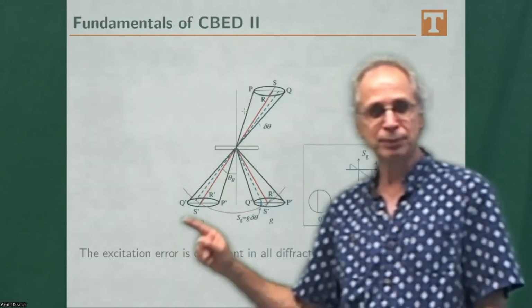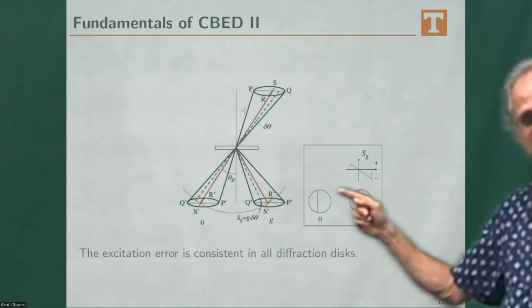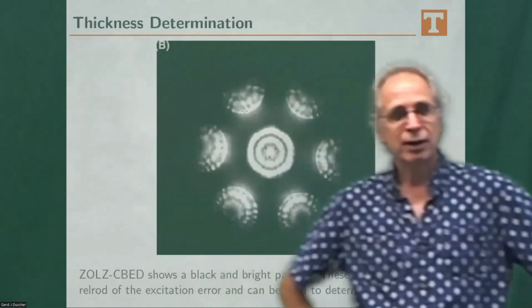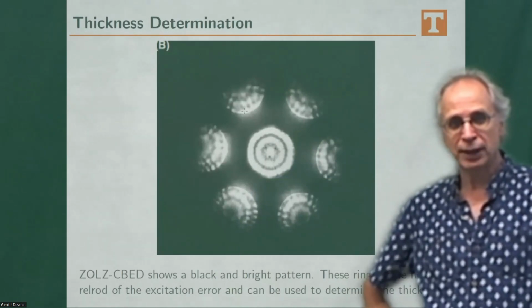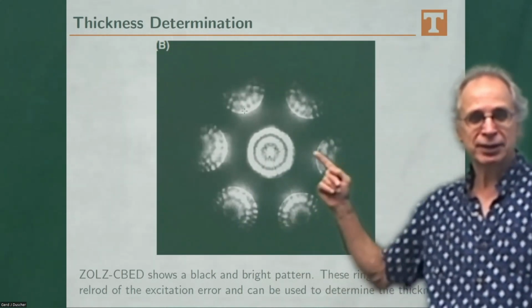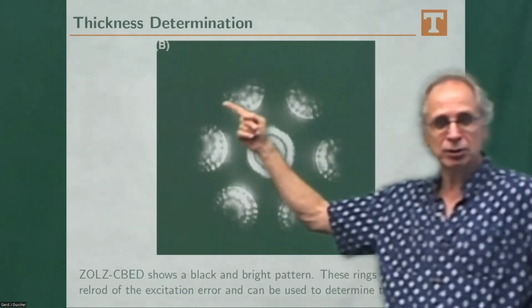If we go in two-beam condition, we do it very accurately. Now here's my cartoon of where you have positive and negative excitation errors. And you can think about it with the Ewald sphere. And then now if we look at this kind of convergent beam electron diffraction pattern, we know these patterns are our excitation errors. We can simulate those.